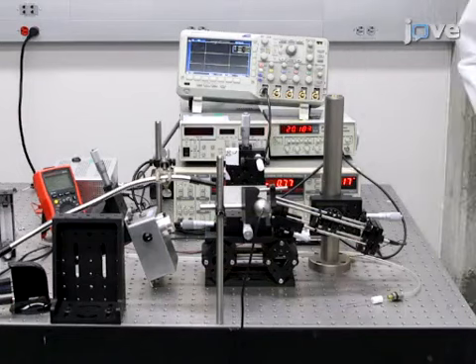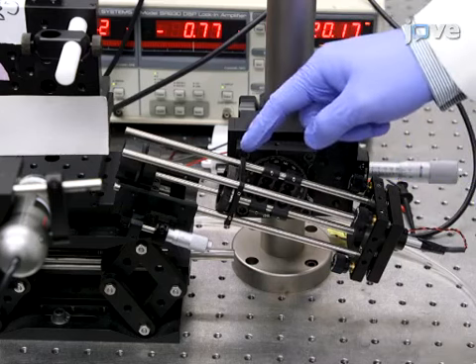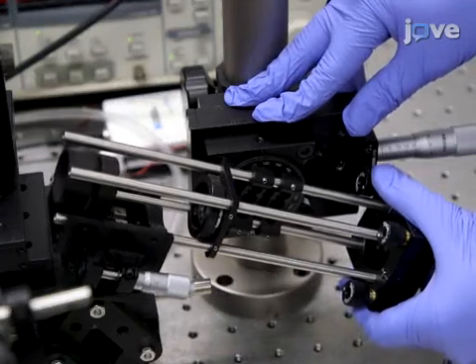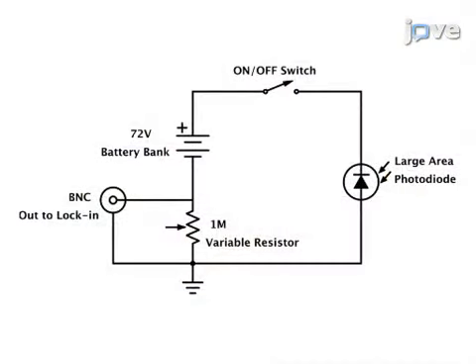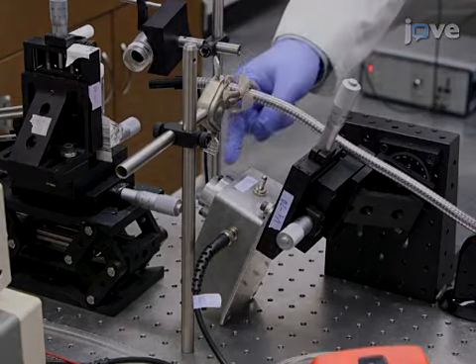Use as the absorption spectroscopy light source a 670 nanometer diode laser, in line with an adjustable iris and a 50 mm lens, all mounted in a 30 mm optical cage system mounted on a goniometer to allow adjustment of the angle of incidence. Use as a photodetector a large area photodiode wired in a reverse bias leakage circuit, with a 670 nanometer bandpass filter in front of the detector. Mount the photodetector on a second goniometer.